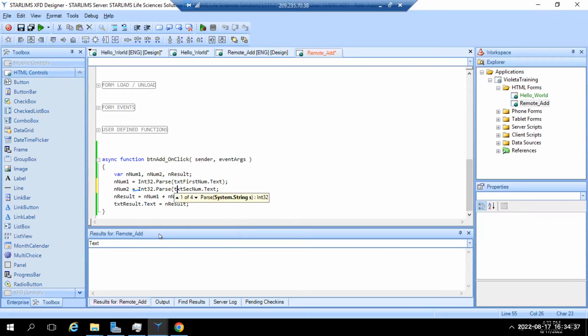Yep, open the parentheses. Do we need to do it for this one? No. Anybody, why? Because we have already done it. Yeah, exactly. Because we're guaranteed, right, to have a number here, because we're converting them. However, what happens if we didn't have that property and they give an A in here and then it tries to parse? This would crash.